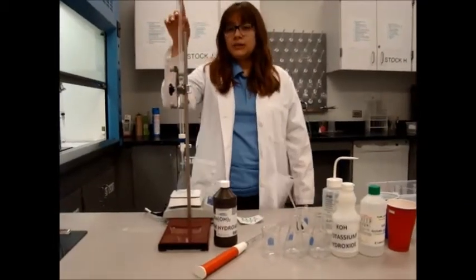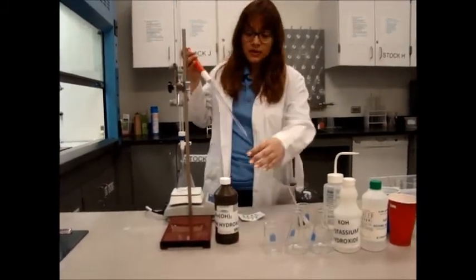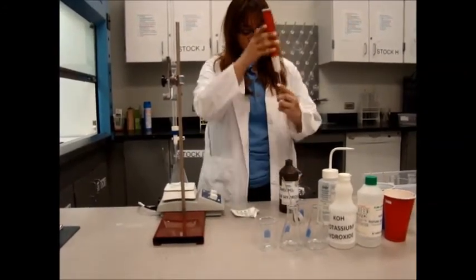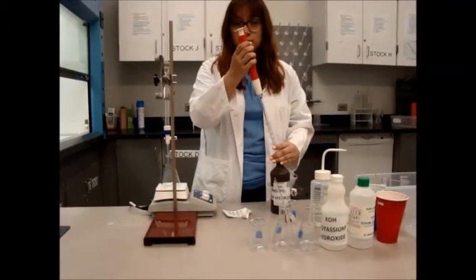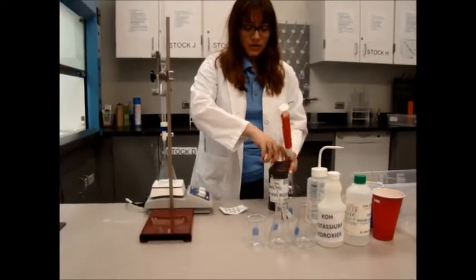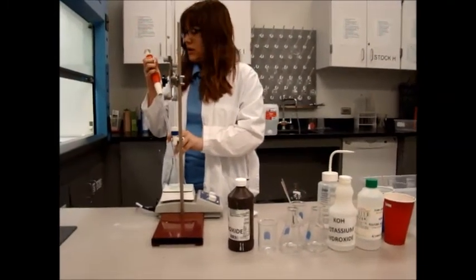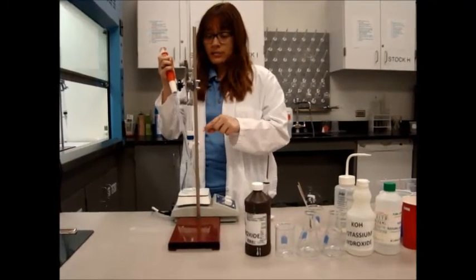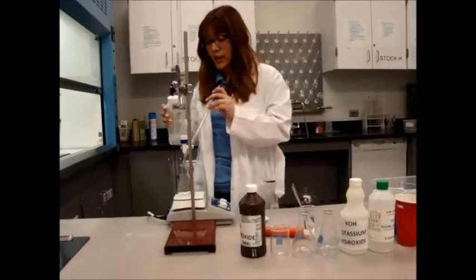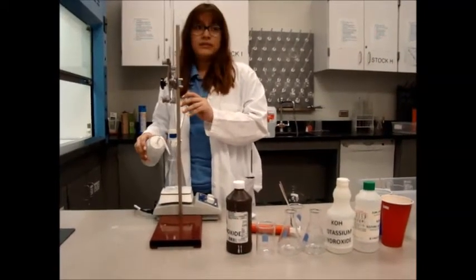Inside of this burette you will already have 50 ml of sulfuric acid. You are going to take the pipette with the pump, go into the bottle, and take 10 ml of barium hydroxide. Make sure to do this motion right here. Once you have your 10 ml of barium hydroxide, go into the conical flask and deliver it in. Once done, take the pump away. Then take the distilled water and rinse out both the inside and outside of the pipette.